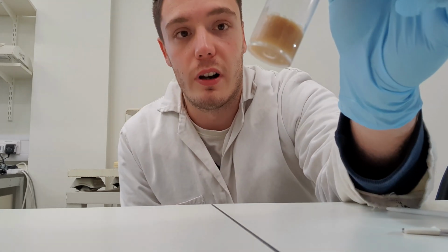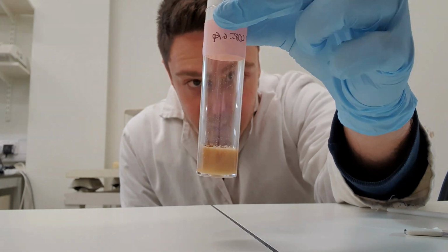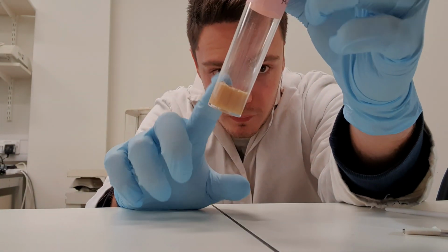This time I used a different model organism called Drosophila, which are common fruit flies. You can see here I have a vial of Drosophila with food at the bottom. These are a really powerful system for many reasons, but the main one for me anyway is that they have a high genetic tractability, so we can manipulate their genome very easily and express things that we want. So for my project, I wanted to express human tau within the Drosophila and then see how this moves throughout the brain or propagates over time.